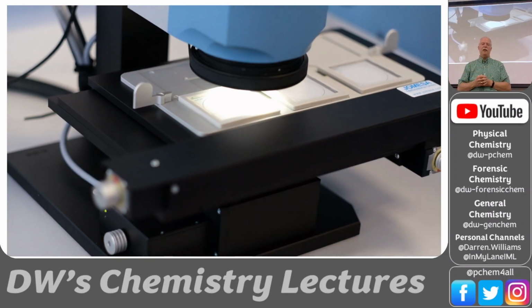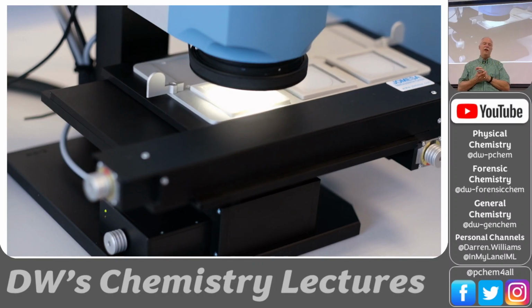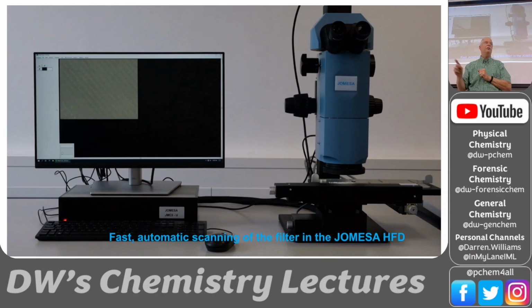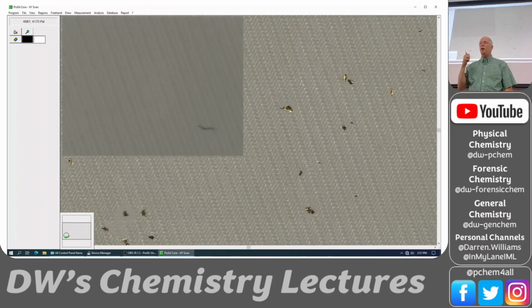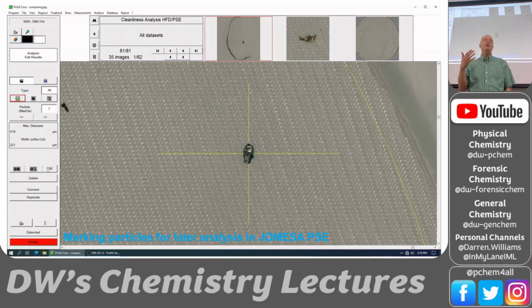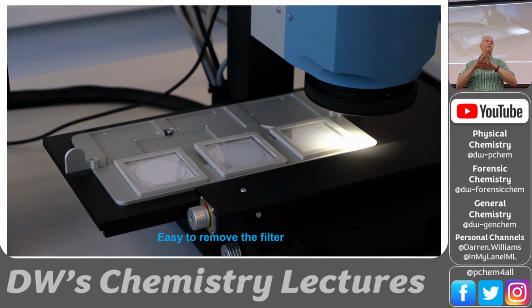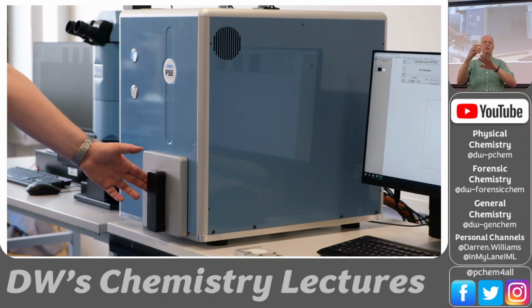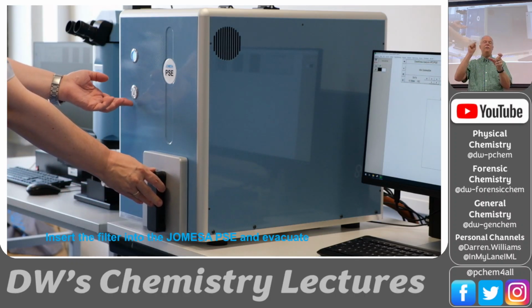So a couple of little reference marks. You can put it in the SEM, and the computer keeps track of the location of every particle.